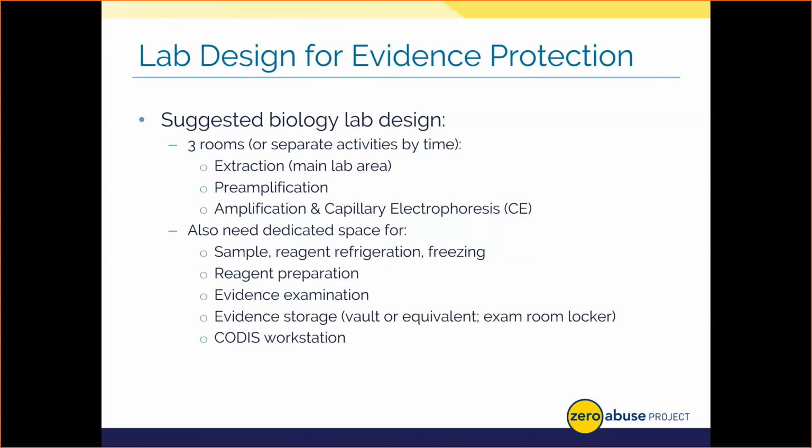All this to say, if you look at the Scientific Working Group for DNA Analysis Methods, or SWGDAM, guidelines, that's acceptable. Some labs are just not going to have the space and the equipment to do everything separately. So you have to make the lab space work for you and do your best to achieve some of these accommodations.